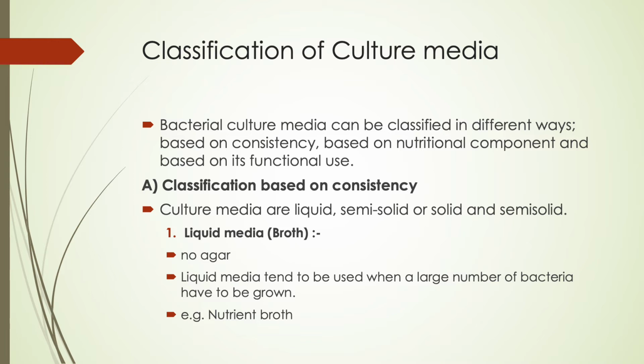So the classification of the culture media depends on you. But overall, the classification is based on, as an example, the consistency, and based on the nutritional components, and based on the functional use.